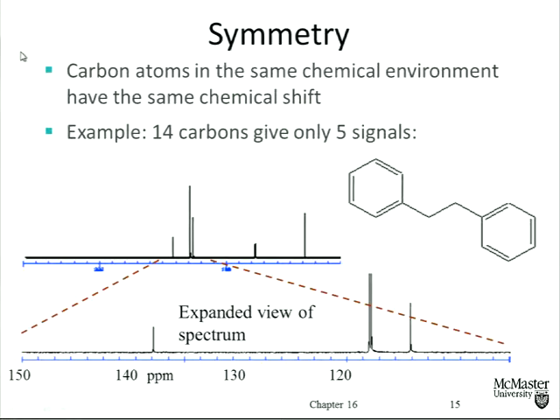There's the one on the benzene ring where the alkyl group is attached. Is that the same as the one on the other side of the benzene ring where the alkyl group is attached? Yes. So those 2 carbons are in the same environment. And chemical shift in carbon NMR tells us about environment. So if the environment's the same in the 2, do we get 2 signals from those 2 carbons? No, right? We get 1.